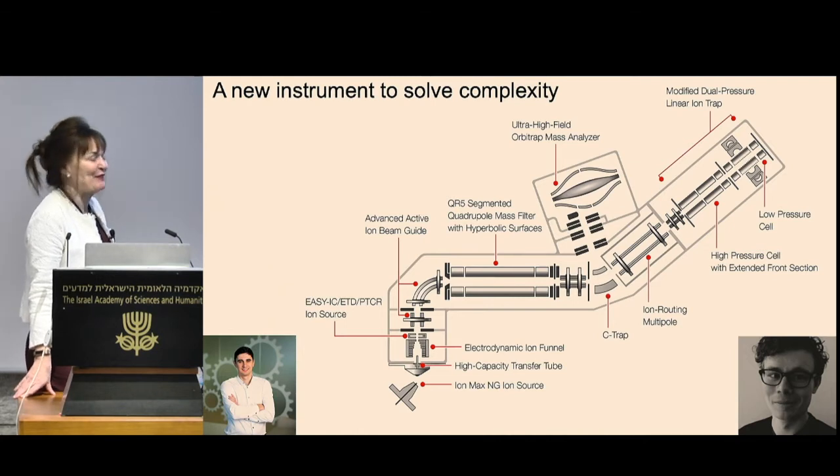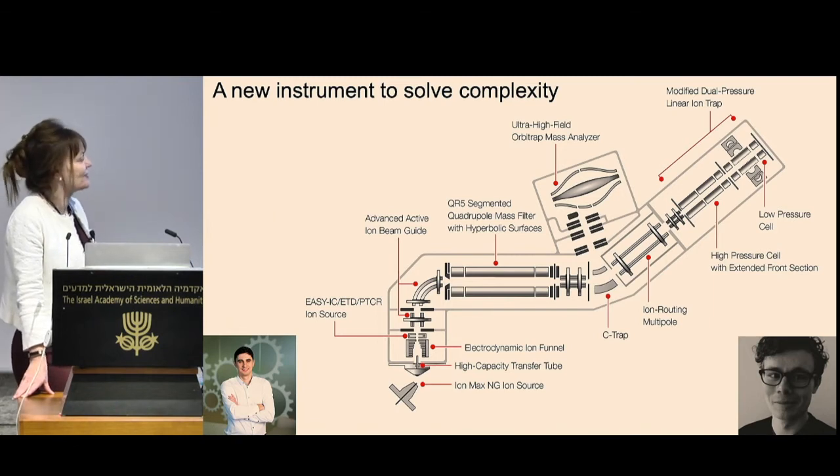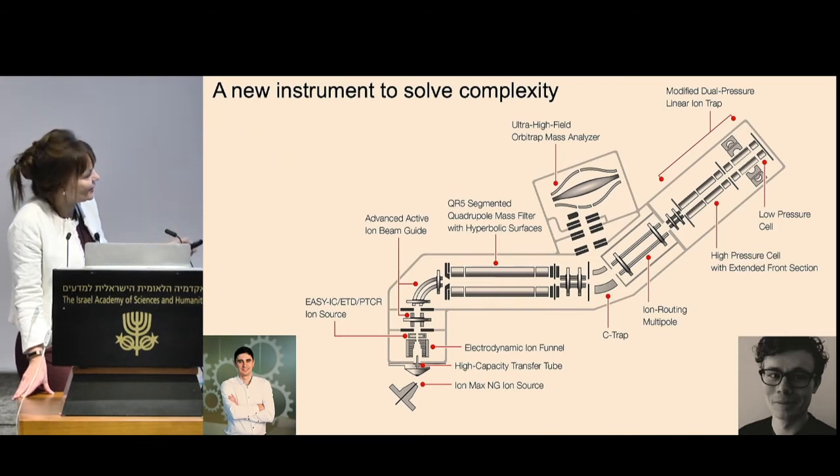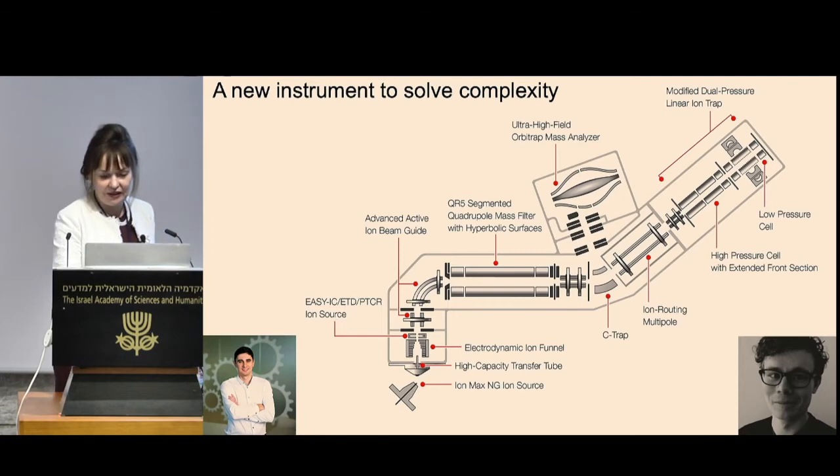I don't think you're going to buy one, but it's very expensive. It's actually getting ridiculously expensive. It's like £1 million for this piece of instrument now. In goes your membrane protein from the membrane through here, into here, and then you can do this multiple times, in and out of the mass spec each time to select something, break it, have a look at it, select something else, and keep on going until you've worked out what it is.